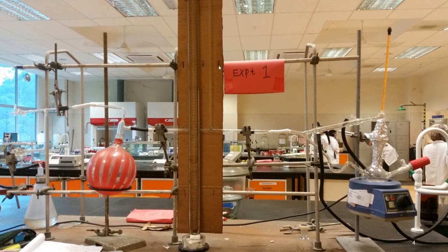So this is the setup for experiment 1. We can't do this, so I'm just going to explain to you what's going on here. This is where the tert-butyl alcohol is going to be. There are boiling chips in here so that it will boil evenly. It's wrapped with aluminum foil so that the vaporization process is contained in there. Then you have the Liebig condenser here.